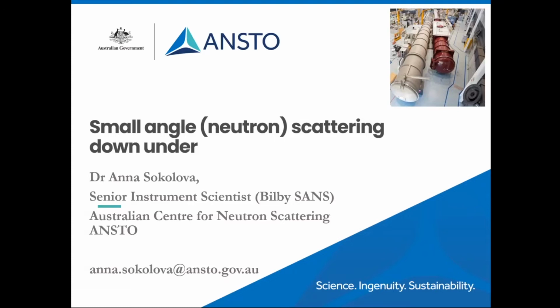Bilby is one of the small angle scattering instruments here. It's my instrument, which I built. Of course I could talk about Bilby for half a day if you did not stop me. But I thought I would get a bit wider and tell you what we have. If you need more details, you are always welcome to talk later on.